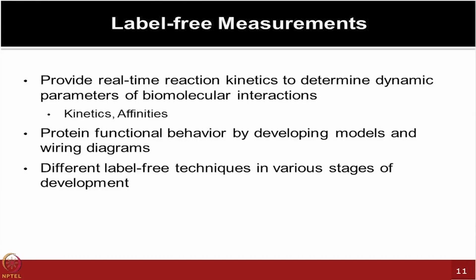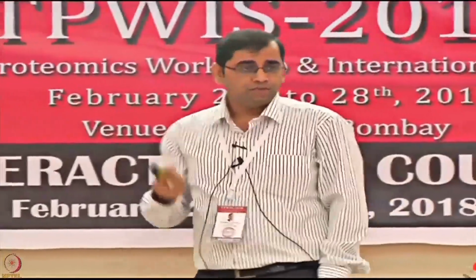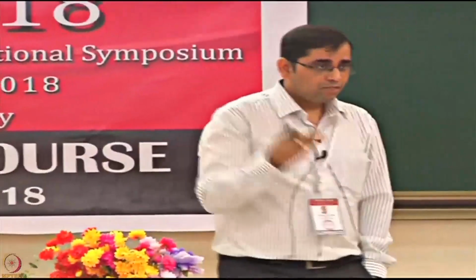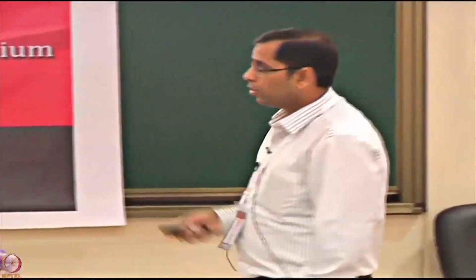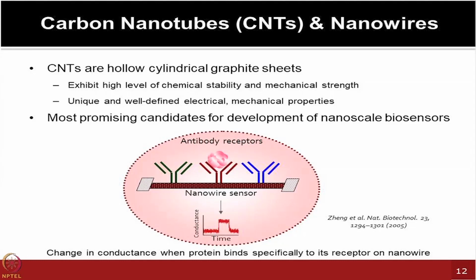So different types of label-free techniques, as I mentioned, are in various developmental phases. Of course, Biacore is pretty leading in that way, because you already have over 20 plus years of the technology in the field. But many technologies which are still just emerging, including some of the biolayer interferometry based methods, have come up really fast. Even MST technologies are emerging. So those could be good platforms to be used. I'm just showing you very briefly some of the principles involved in various types of label-free technologies.